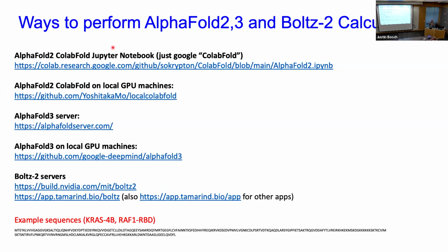So what Colab has done is you basically click and say, run this program and do this calculation. And you're using GPUs owned by Google. They've got excess capacity because they've got extremely large resources. And so you're using their GPU time. If you spend $10 a month for a Colab account, you get more time, and it doesn't time out on you. You can buy a certain number of credits. There are different ways to do that.